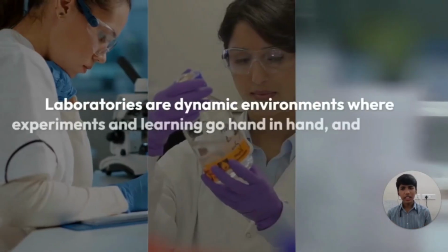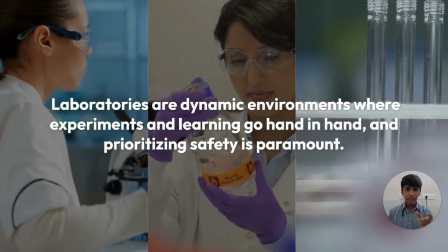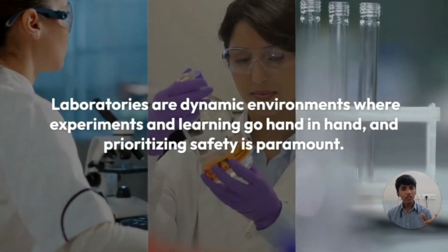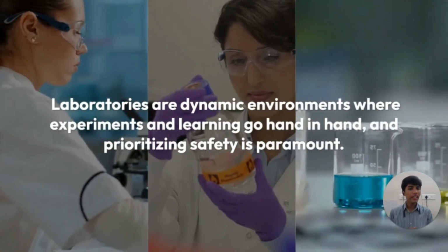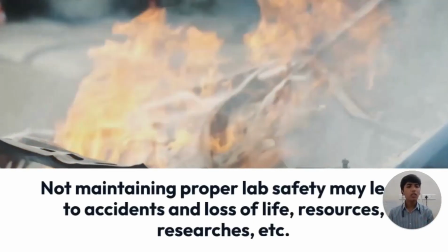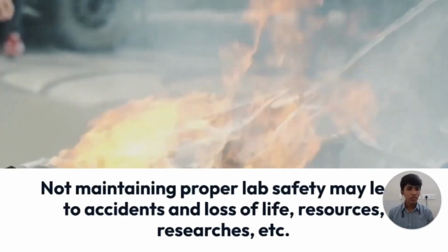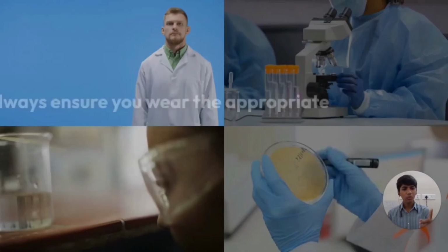In the safety lab, you should always be very alert about what you are doing and how you are doing it, and what safety precautions you should maintain while doing an experiment, since it is a hands-on experience. The lab has a dynamic environment. If you don't do this, you will be in a problematic situation, like there may be accidents, loss of life, loss of resources. So to avoid that, you should follow proper practice.